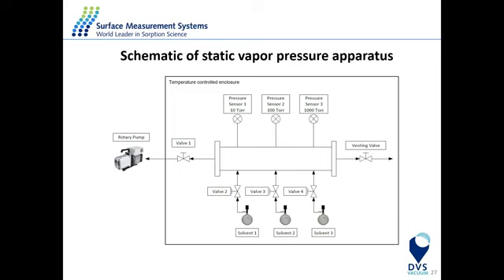What we're measuring here: first, we basically outgas solvent number 1. We open the valve, we pull the vacuum, and the pressure will decrease. During the outgassing process, we remove all the air about the molecule until we reach the state where the rates of evaporation and condensation are equal. Once we reach that state, we close the valve, which will isolate the pump, and the pressure inside the vacuum chamber will reach the saturation pressure.